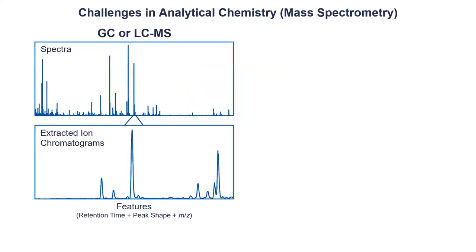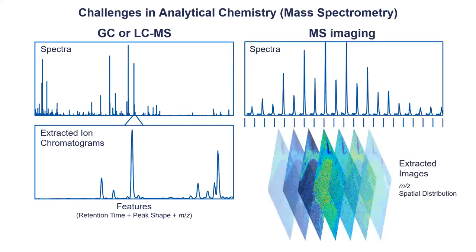So what I want to make sure is we have seen so many different tools or hyphenation options, but in the end, whether GC, LC, or imaging, we acquire mass spectra in the end. So we have m/z compared to intensity. And of course, we have some additional information based on the system that we use. But the first thing that we should be aware of is that the mass spectra are kind of the same. You add retention time as a different identification and separation dimension, and in imaging you have the spatial information as well. But the first spectra are kind of the same idea.